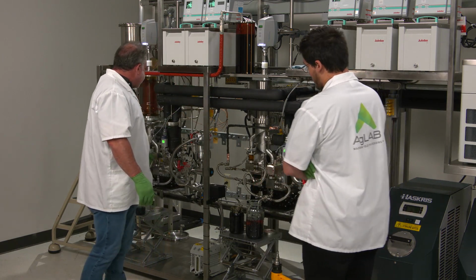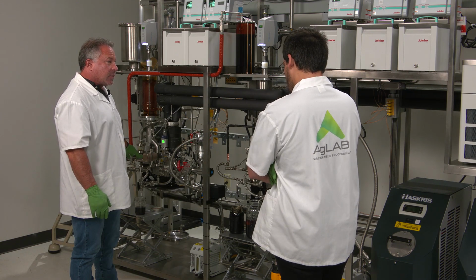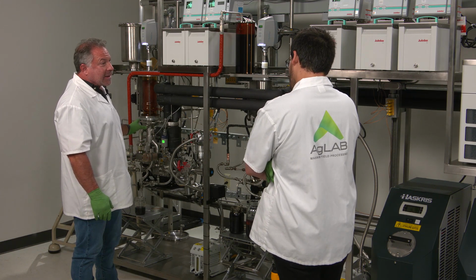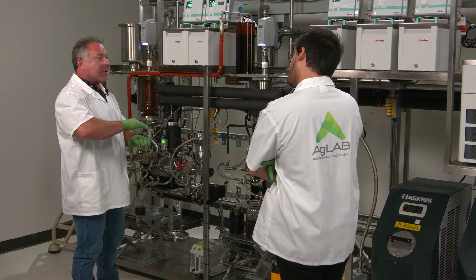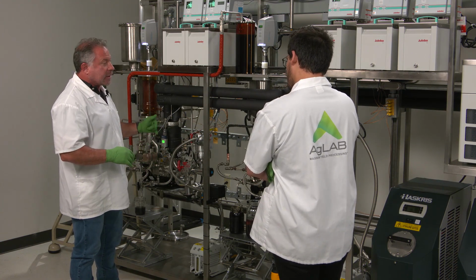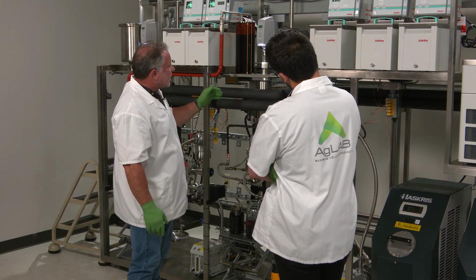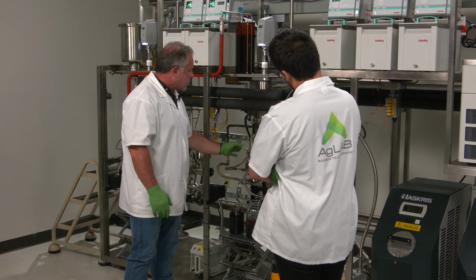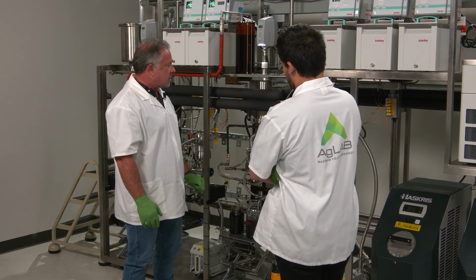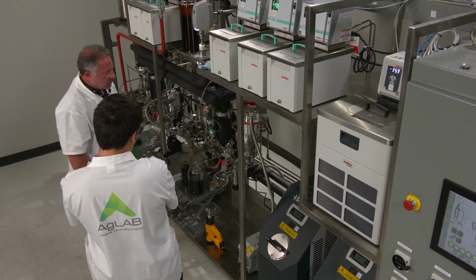We want to get down to that range of 5 to 10% terpenes over here, because we want to make sure that we get everything off in that whole range, some of the heavier ones. We want to make sure that those come off, because in this second stage, same as our first, we have the evaporator, condenser in the center, residue on this side. This is our distillate on this side, cold trap, and a vacuum system here.